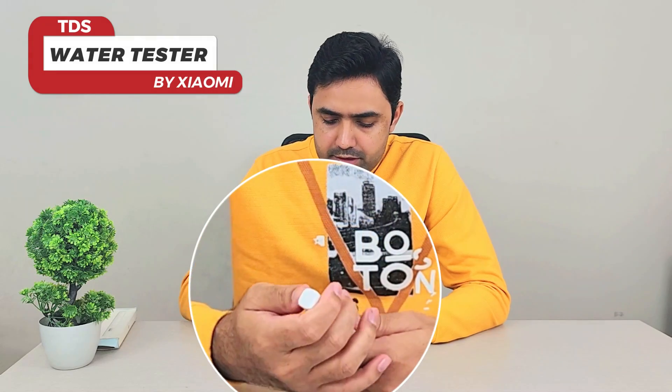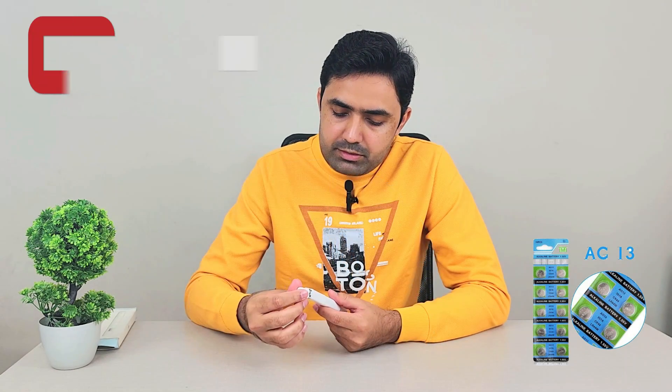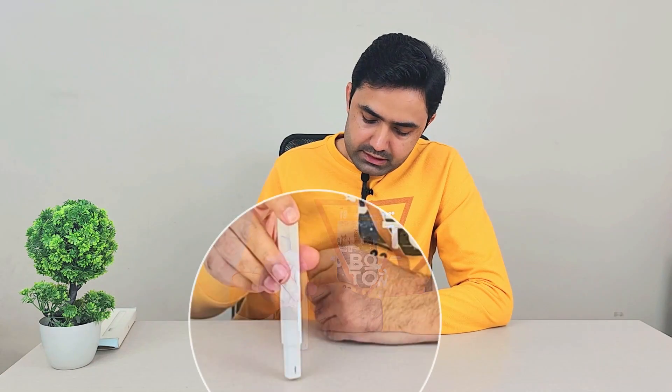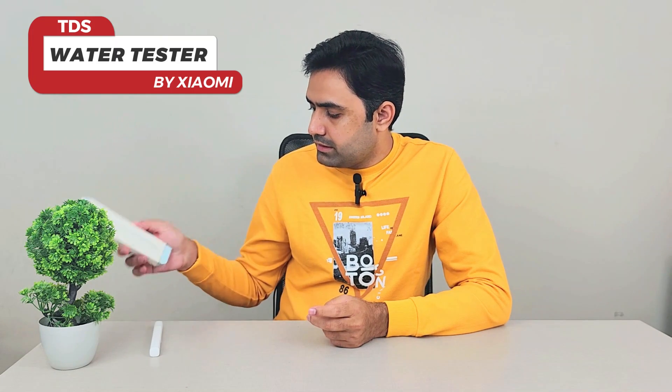At the top you have AG13 / LR44 button cells that you can replace once they run out. This tester automatically shuts down after two minutes of not being used, so it's very battery-conscious — the button cells will last almost two years. On the front we have the screen that gives you the number, a button to turn it on and off, and at the bottom you have the testing probe which you put inside the water to get the TDS value. Very clean and minimalistic design.